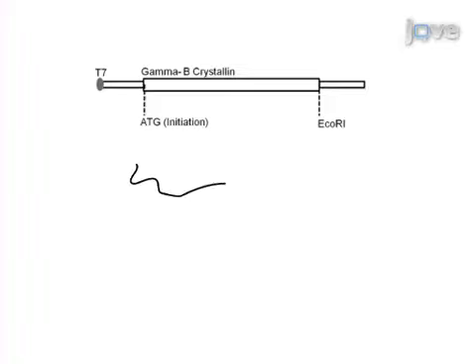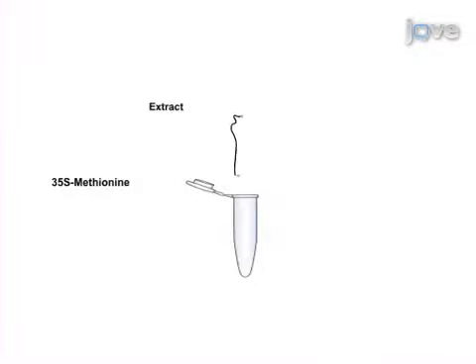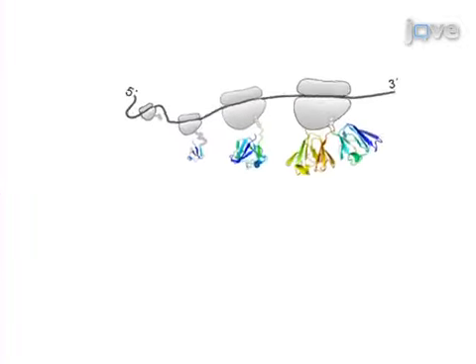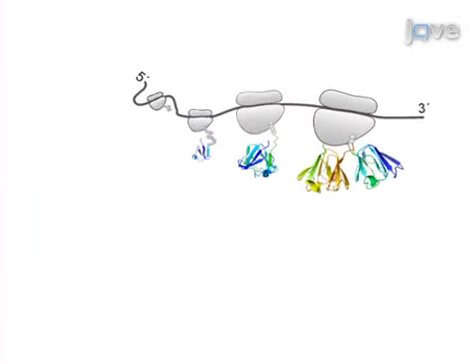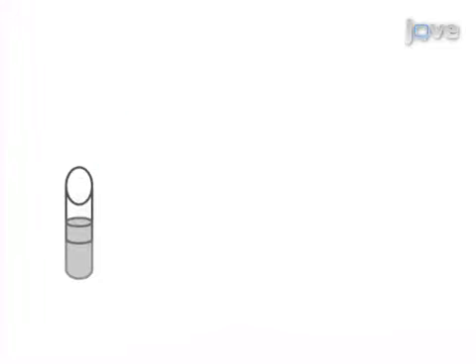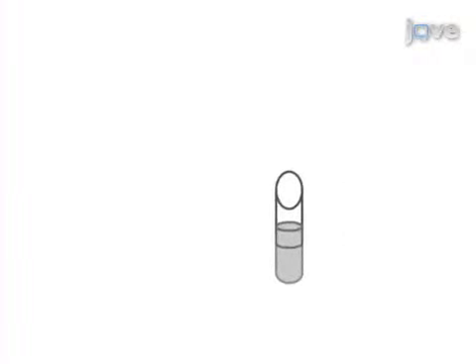Next, mRNA is transcribed and purified. Then, in vitro translation is performed in the presence of mRNA and radioactive amino acids to label the synthesized protein and nascent polypeptides. Finally, the polysomes are isolated using sedimentation velocity centrifugation, and the isolated nascent chains are resolved by gel electrophoresis.